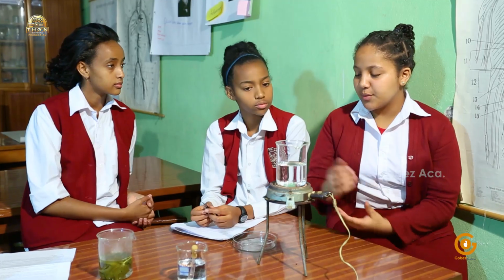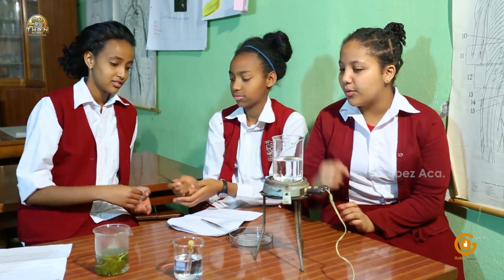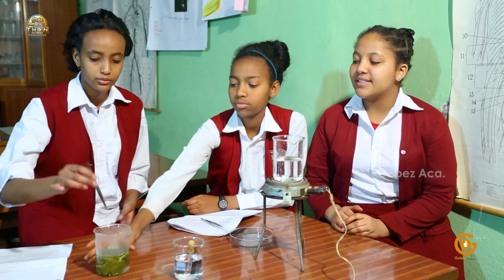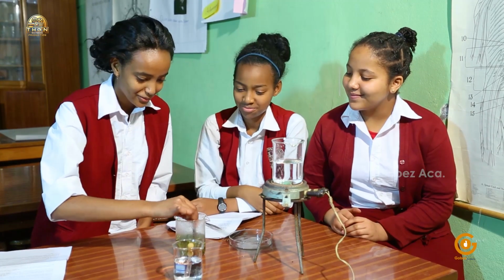Now the ethanol has boiled, and Mahadev, please put the leaf into the boiling ethanol and boil it until the green color is removed. Sure.